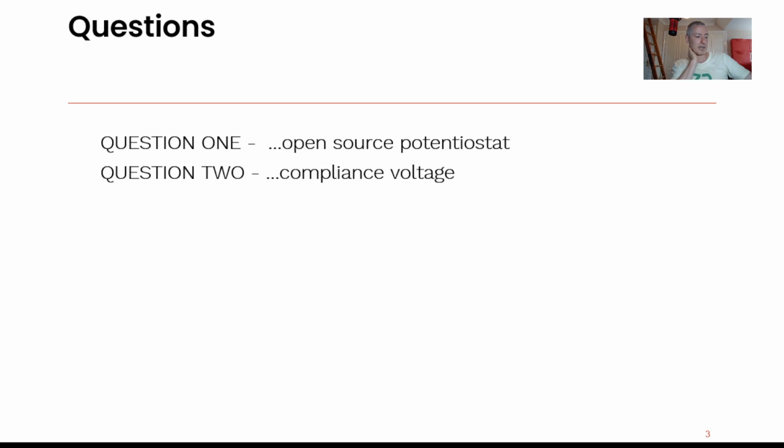A lot of people are asking about compliance voltage, and actually compliance voltage didn't used to be such a thing that people would talk about. I'm just going to grab something again. Compliance voltage has actually become a thing. When potentiostats were large mains driven instruments like this, people weren't talking about compliance voltage, but when they became smaller and started to be kind of USB driven, then compliance voltage became much more of a thing.